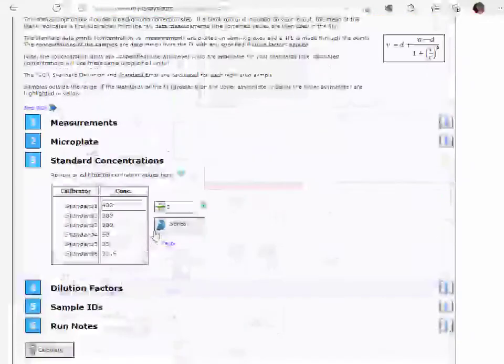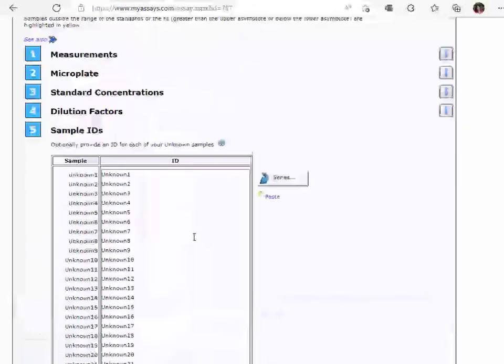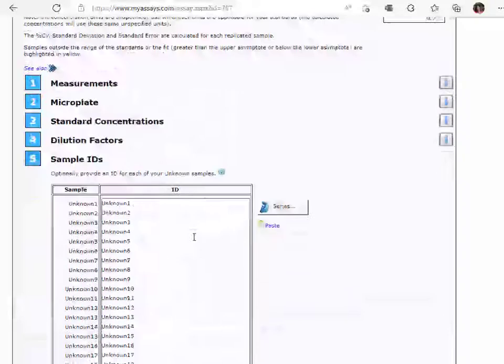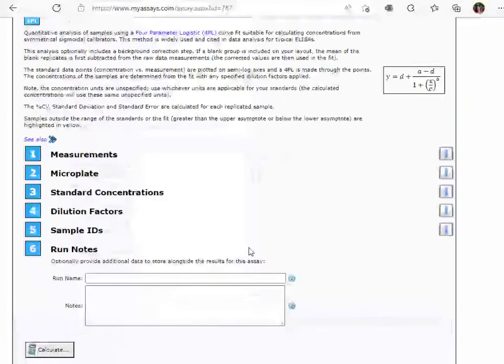Add standard concentrations, dilution factors, sample IDs, and any applicable run notes.